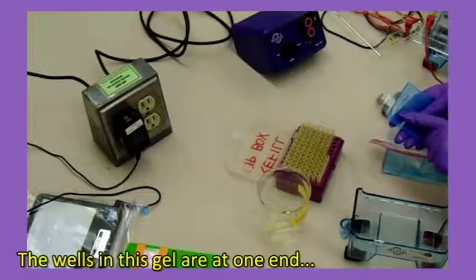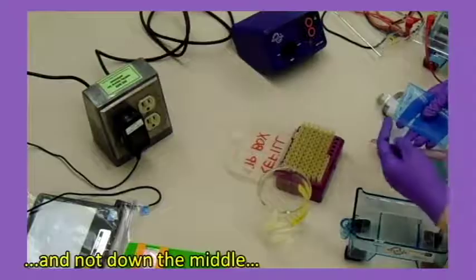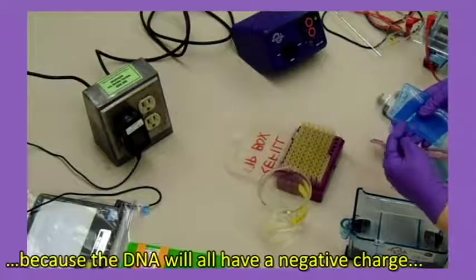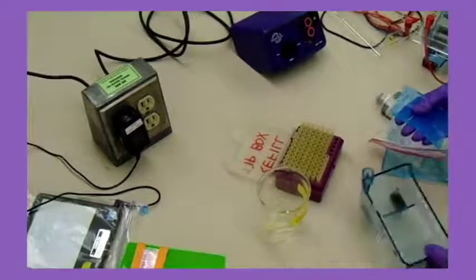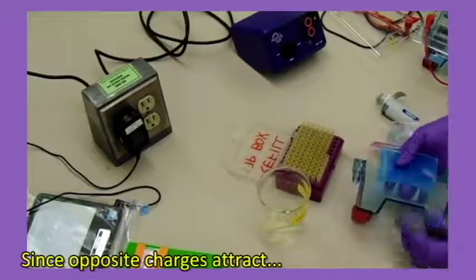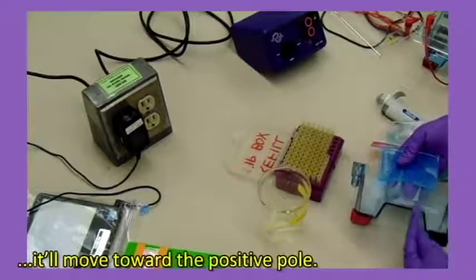The wells in this gel are at one end and not down the middle, because DNA will all have a negative charge and will run in the same direction. Since opposite charges attract, it'll move toward the positive pole.